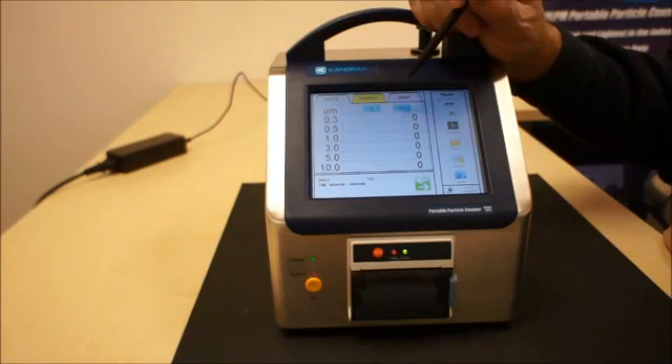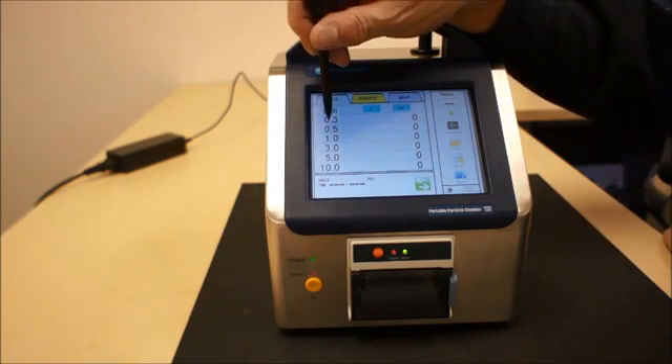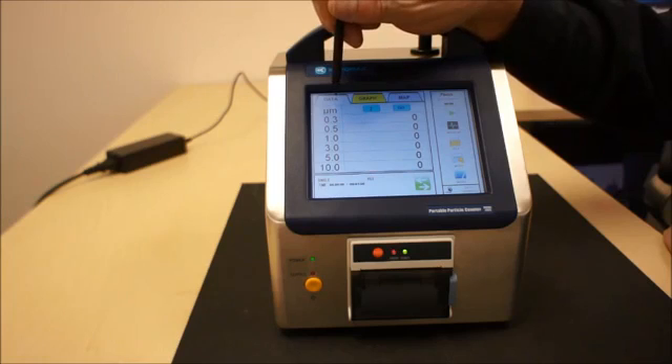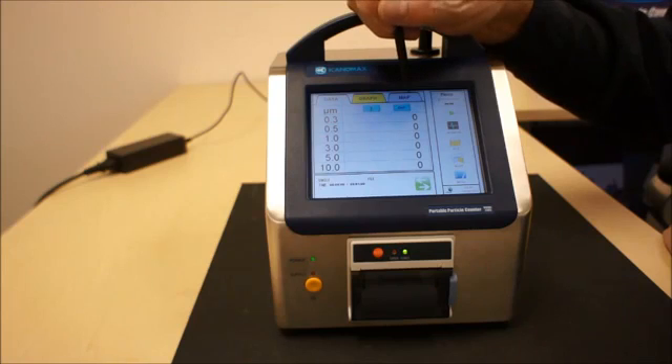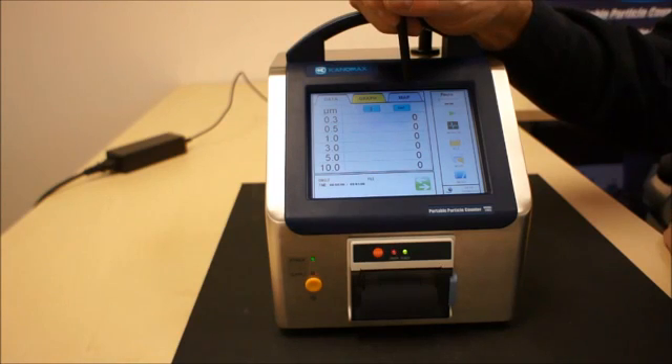The intuitive menu of the 3905 and 3910 series is extremely user-friendly. You can see here the list of six channel particle sizes that this unit will count. The units can be represented in a data format and a graphic format. There's another tab that is representative of a map — you can load a JPEG of a map, and in isokinetic measurement mode you can have individual points identified for measurement, locating the particular points required in your ISO standard.